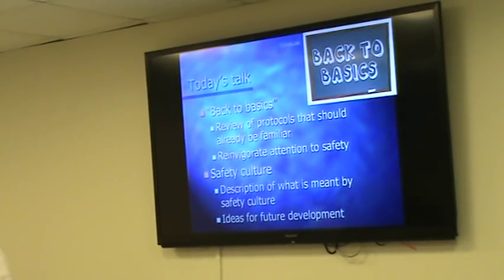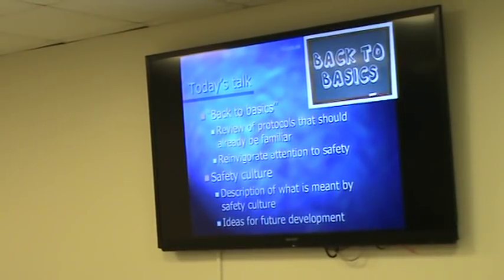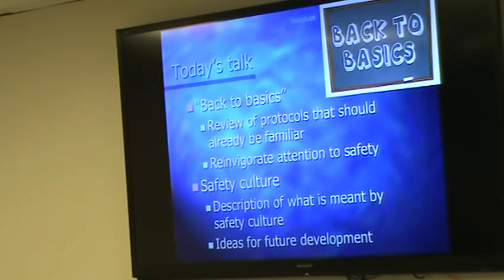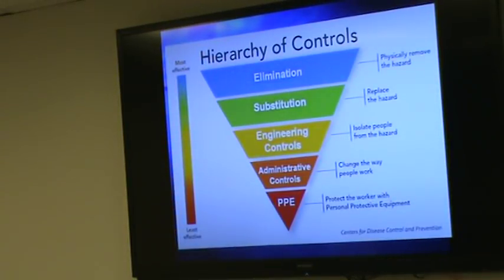Based on what the CQI team found, we're going to do a little bit of back to basics, and I'm interested in making sure that you're reinvigorated by some of these topics, as opposed to thinking, oh wow, this is really deep, new information she's presenting. So we're going to review some of those things quickly. Then I want to introduce to you the idea of a safety culture, which might be a little bit of a new concept for you, but something you might want to consider happening here at Hopkins. And I think you've got a little bit of that with your CQI team already.